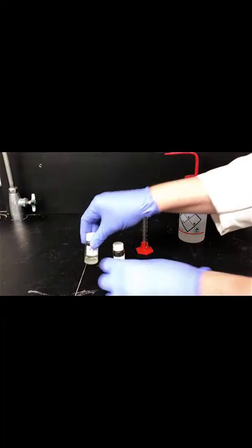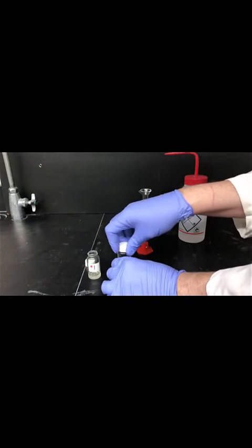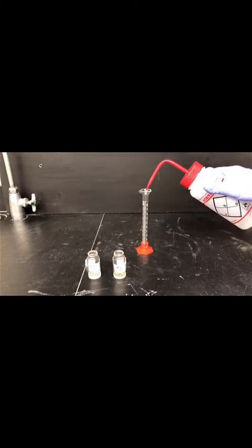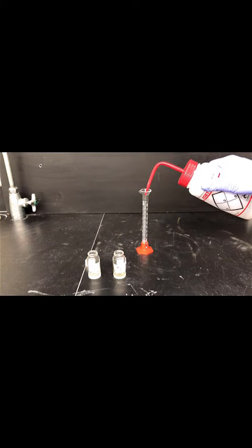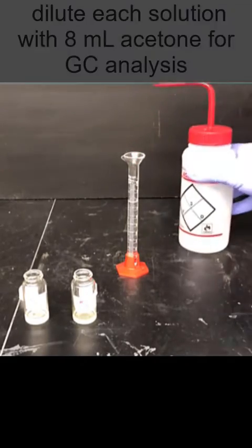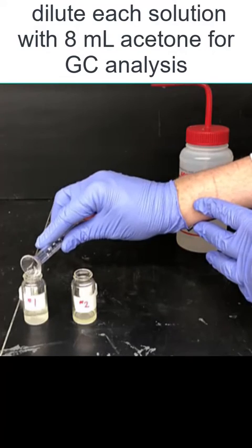In the next part of the experiment, we'll be analyzing these reaction solutions by gas chromatography, or GC for short. Reaction solutions are far too concentrated to inject directly into the GC, so we'll need to dilute them with acetone. If we don't, the signals will be off scale and have flat tops in the GC chromatogram, which isn't helpful for figuring out integrations. Add 8 milliliters of acetone to each one of the reaction solutions and swirl.